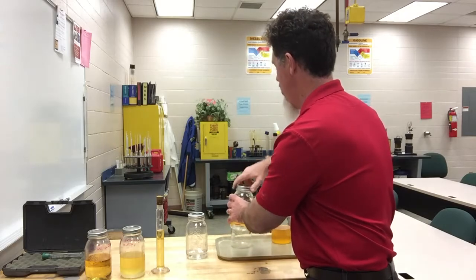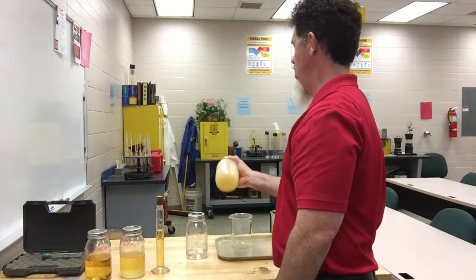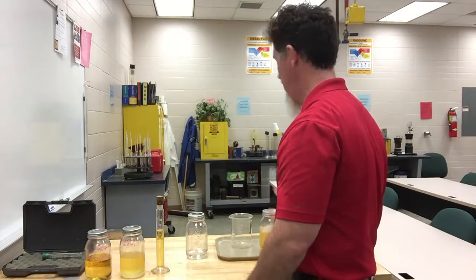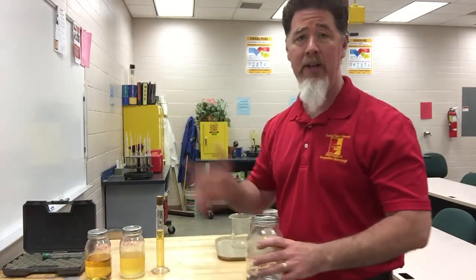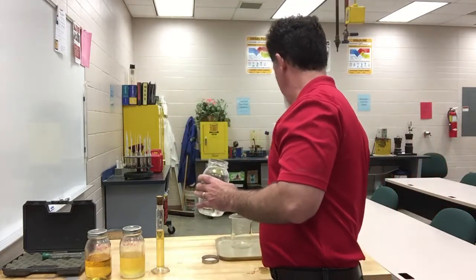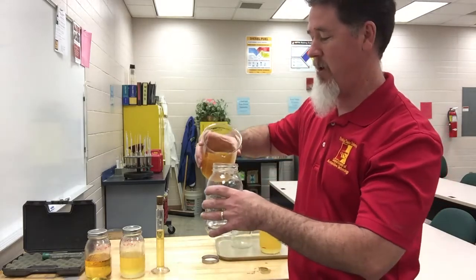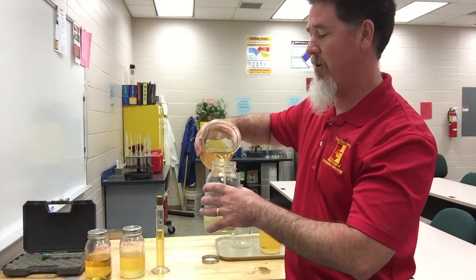I like using jelly jars just because they're tempered a little bit and a little harder to break, and I can seal them up pretty easy, and they're cheap. I can go to any store and just pick up a dozen of these fairly easy. Or maybe your grandma has them down in the basement somewhere that she's not using anymore, and you could borrow a few of them from her.